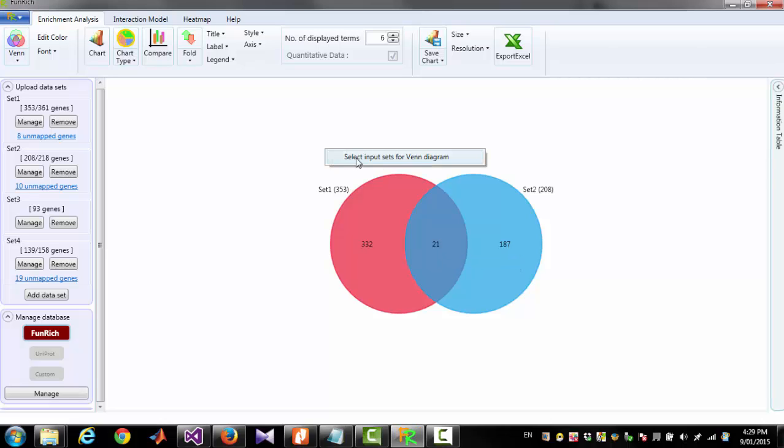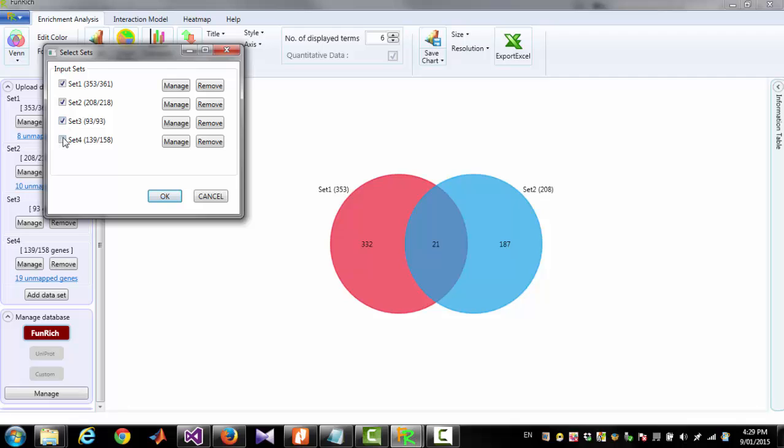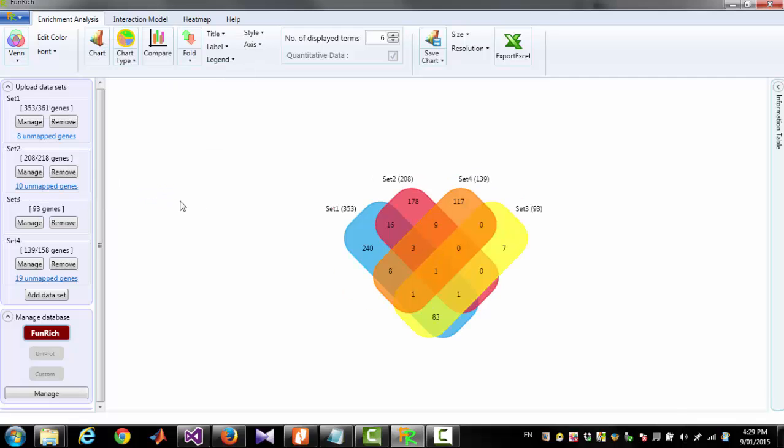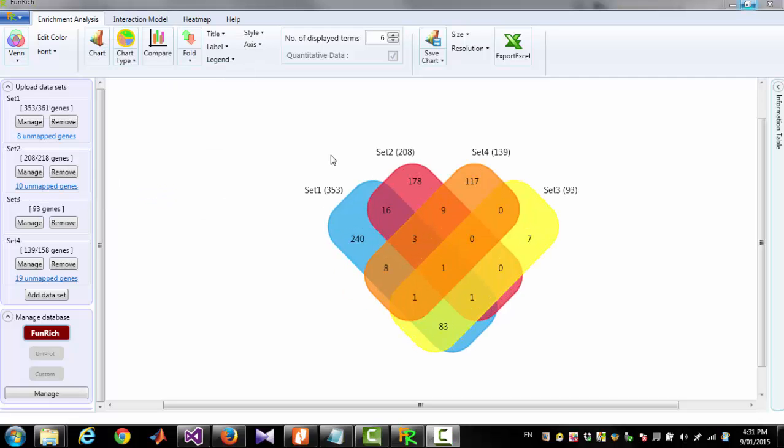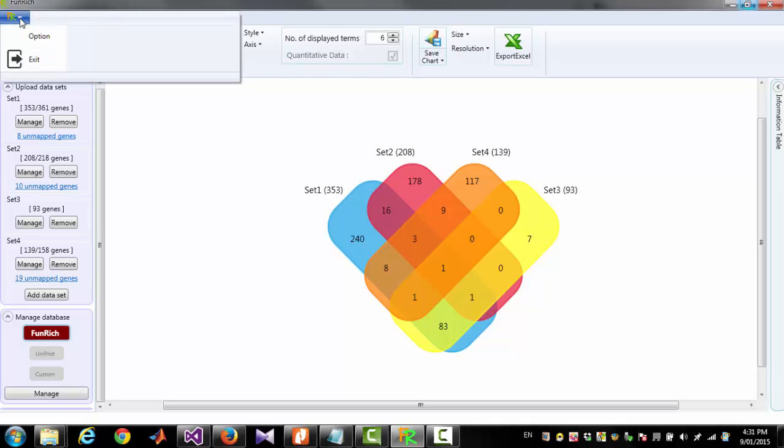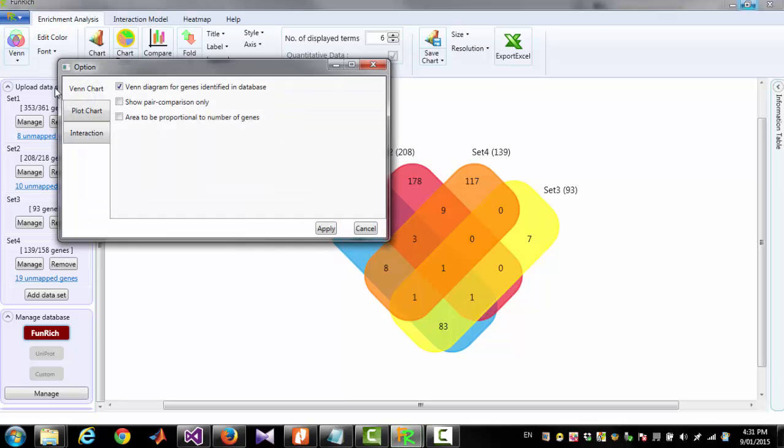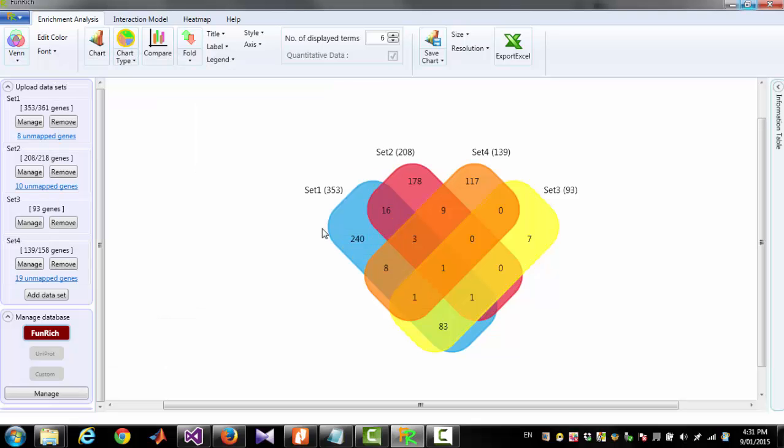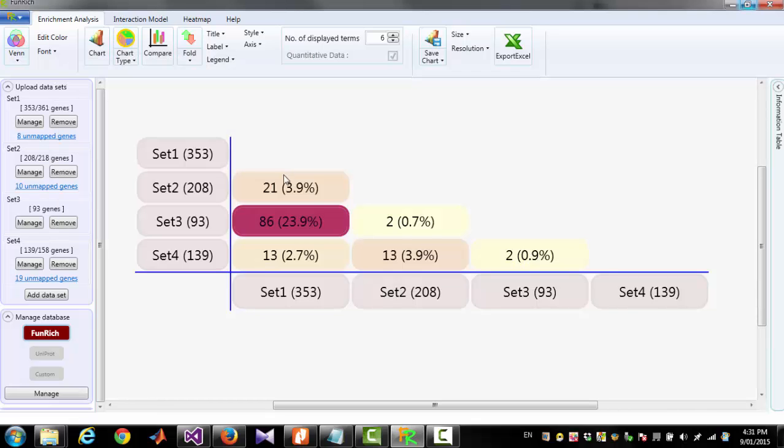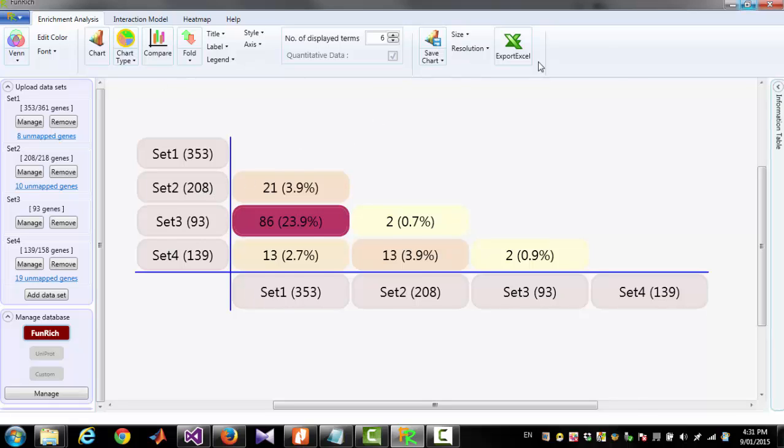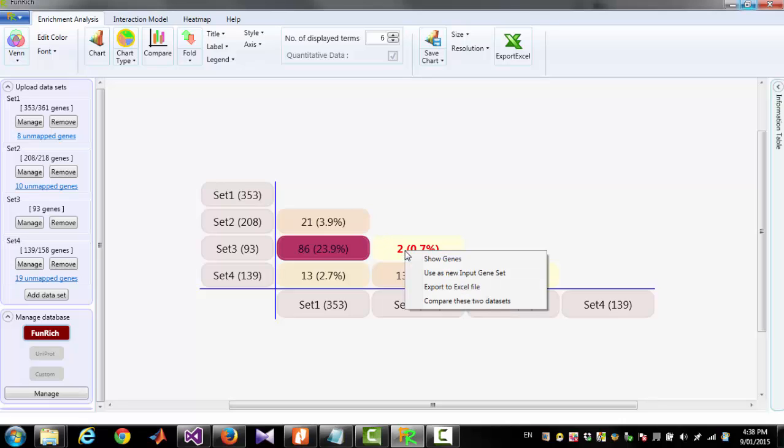Now I am going to select all the 4 sets. To generate the diagram for pairwise comparison you have to click Option, Show pair comparison only. And this diagram will show you how many genes are common to a pair of sets. In this diagram you can see two genes are common to Set3 and Set2.